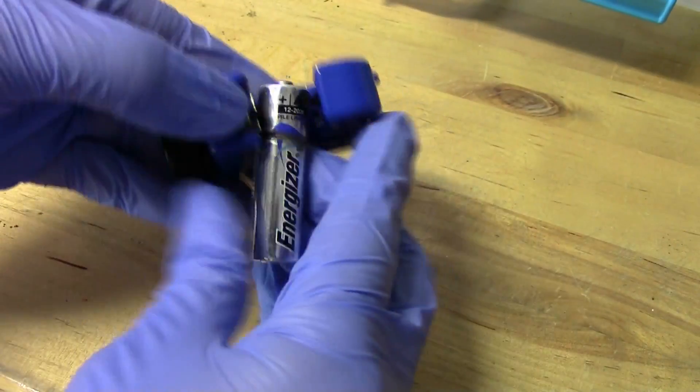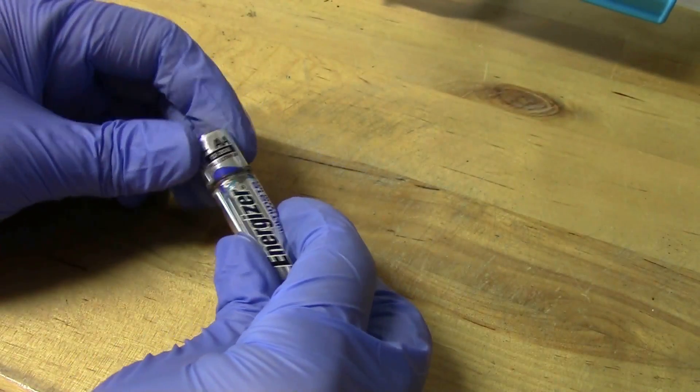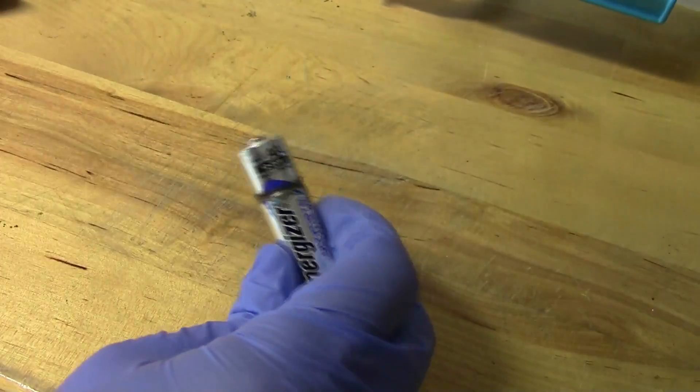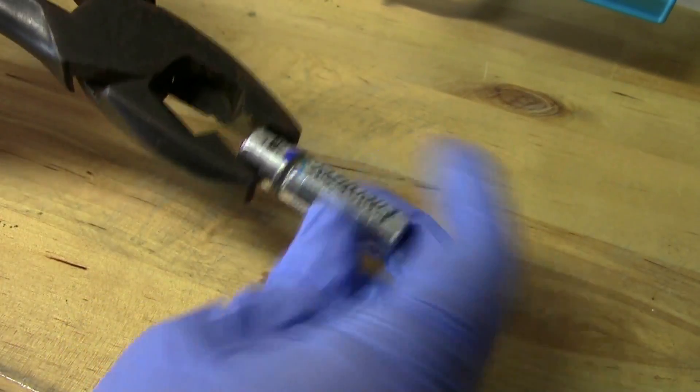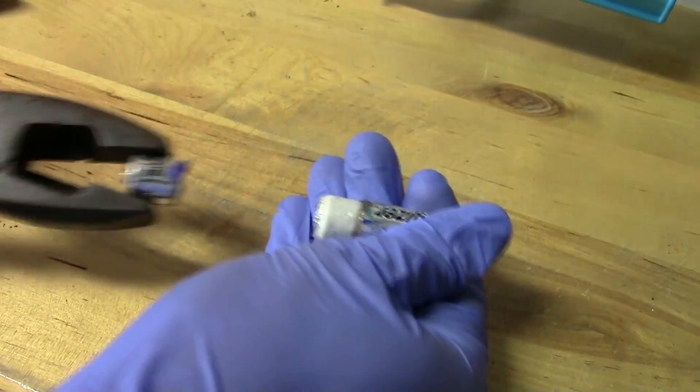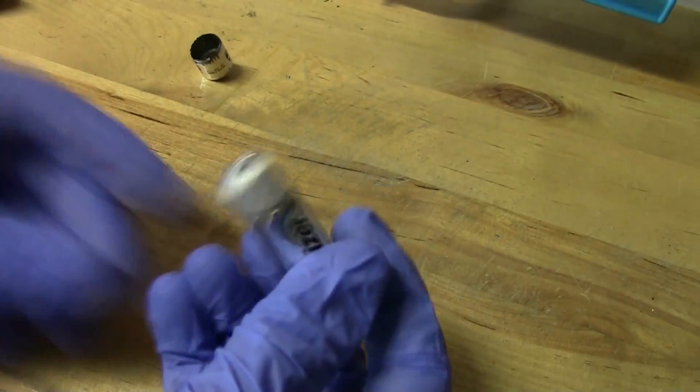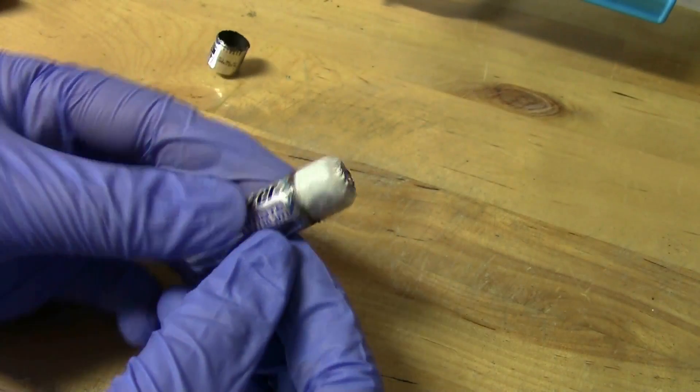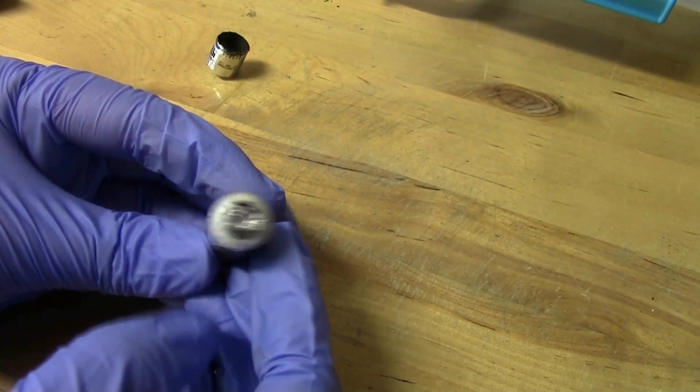All right I've got the cap off you can see it's definitely loose let's just pull that off with some pliers. Awesome awesome so there's the inside of the battery and you can see the metal foil rolled up there.